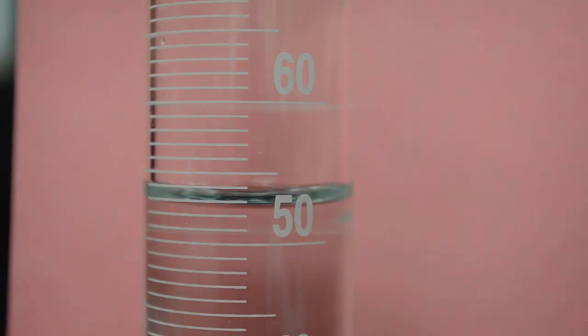Okay, so I would read this, well, it's between 50 and 60. So the first number would be 5 in the tens place. And then I would count up 51, 52. It's between 52 and 53. So that would be the second number, 52 milliliters.